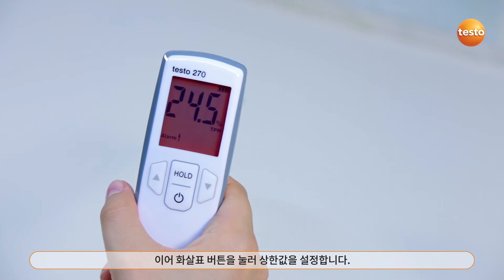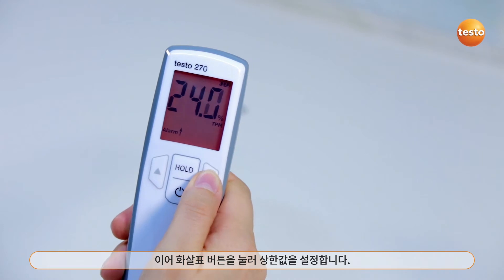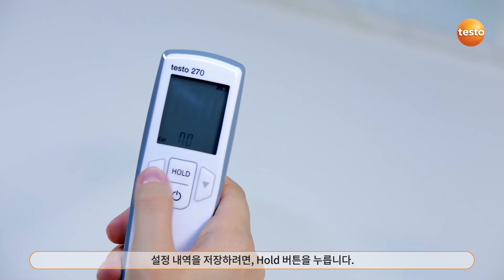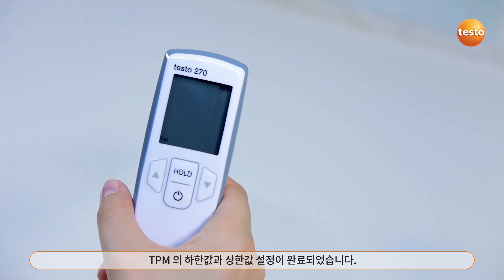Then comes the upper limit value, which I also set using the arrow buttons. To save the adjustments, I confirm with the hold button as before. Only then are the settings for both TPM limit values accepted.